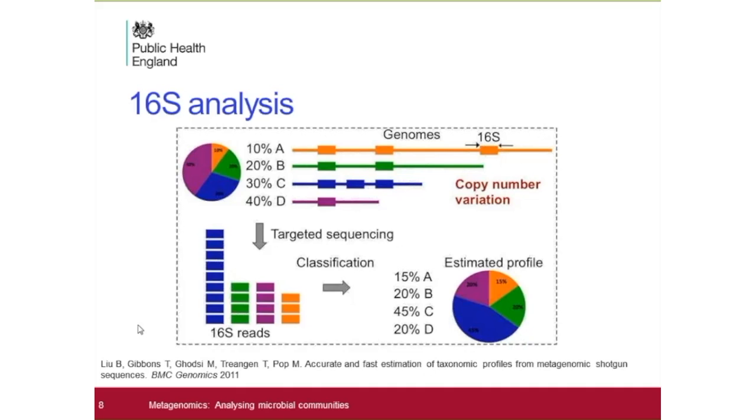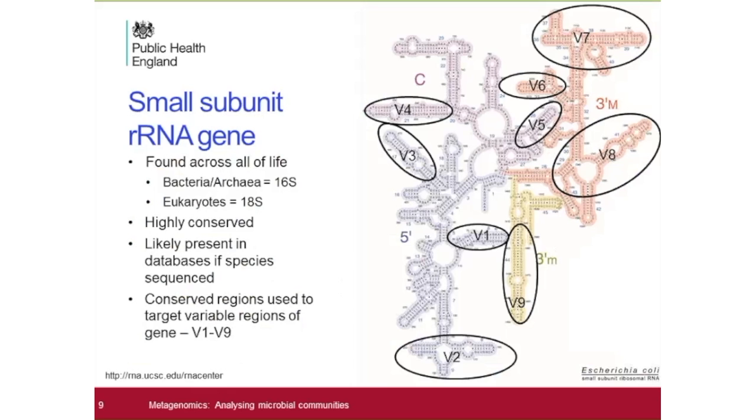within the microbial flora. So that's both a challenge, but also a marker indicator that we need to ensure that we are aware of these variations, or that the sequence data that is being analyzed should be analyzed based on the presence and absence of organism rather than on the percentage, if we are not going to take into consideration the copy number of the 16S loci.